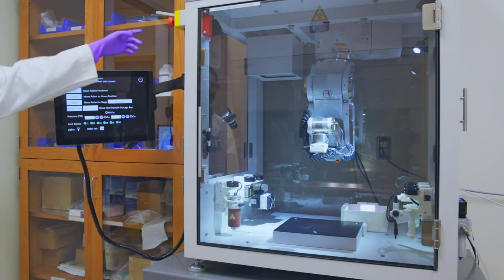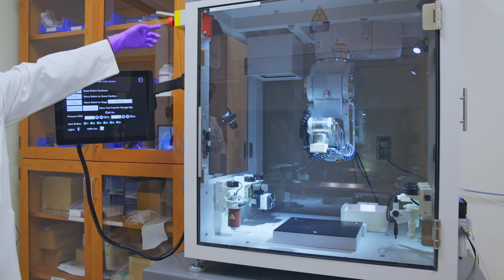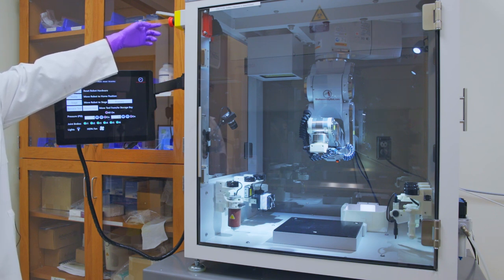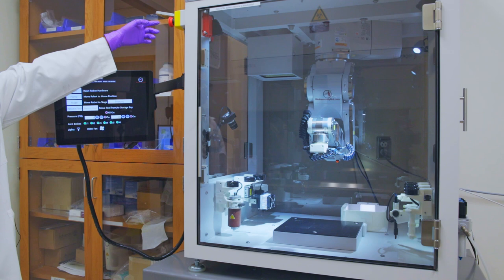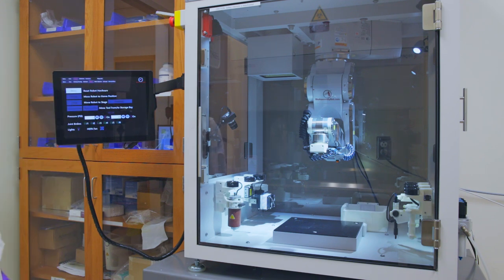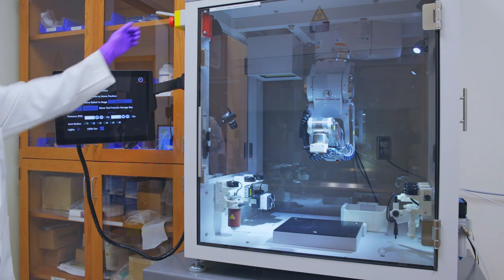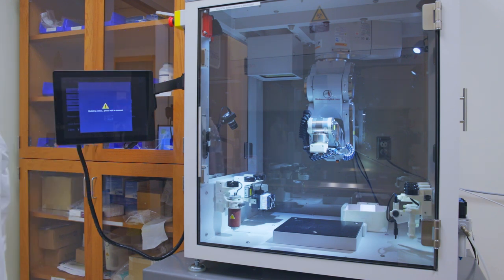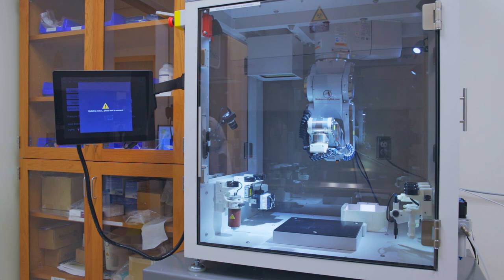This is the emergency stop button for the bioassembly bot. Use this button to stop the robotic arm from moving or dispensing the biomaterial ink. To release the emergency stop, twist the knob, and we are ready to resume our operations.